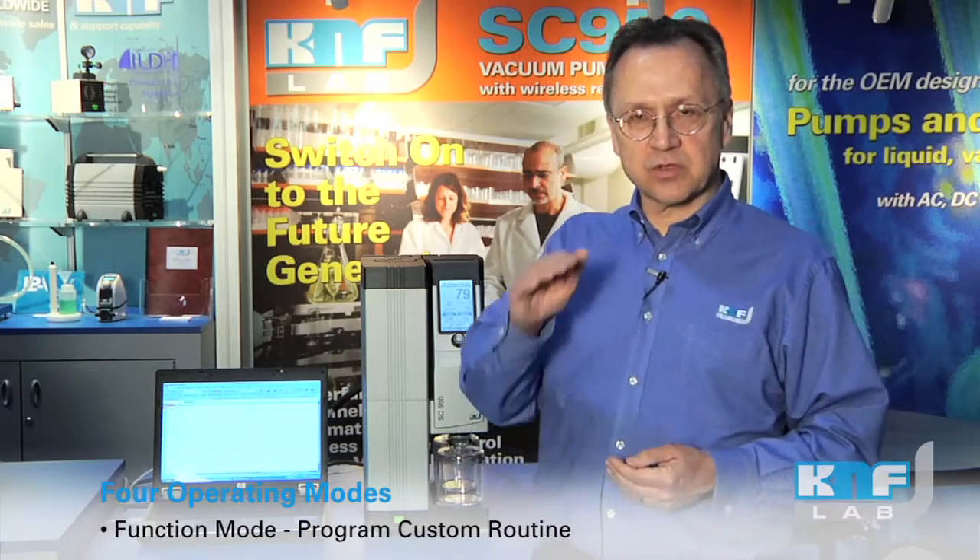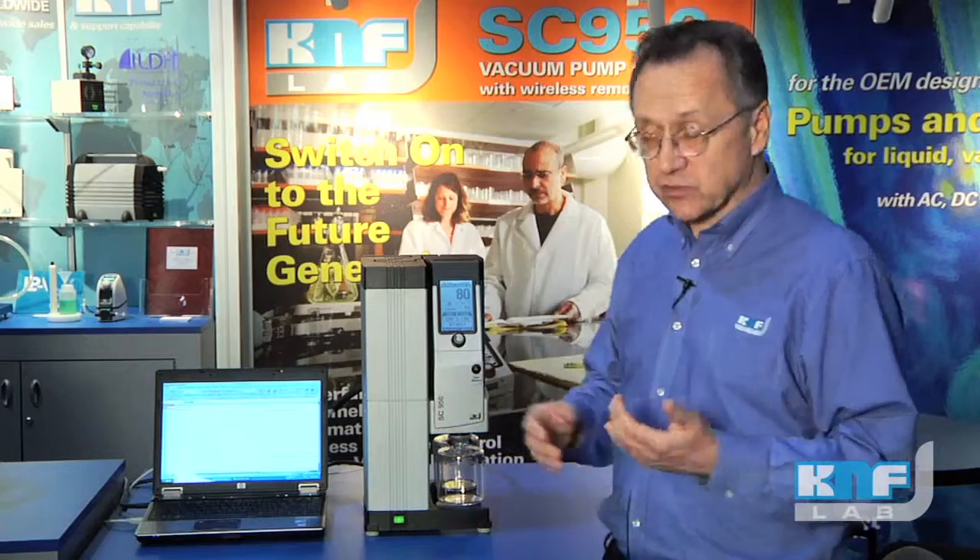Stopping at certain points if you need — let's say you want to degas a sample or remove water from a sample. You can pick a series of set points over a series of time and create your own custom recipe, so to speak.